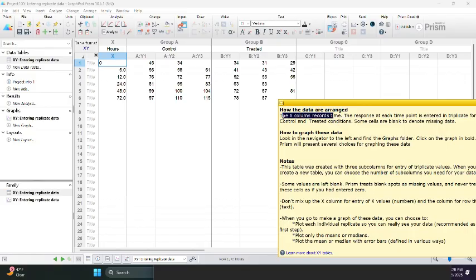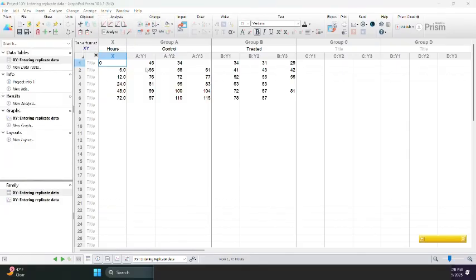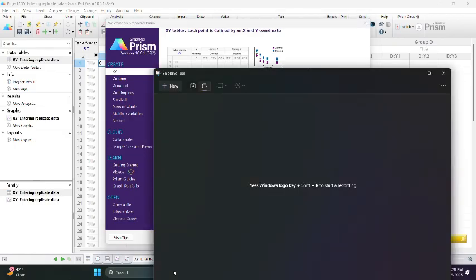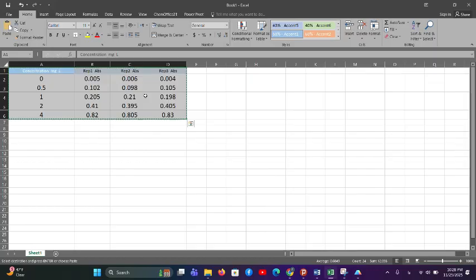So that's perfect. Here I have an analytical chemistry example for you. We're going to determine the concentration of copper ion in a water sample. We are using a UV visible instrument, and we want to know how this method works and if it is appropriate or not. So we're going to draw the calibration curve. Very first, we have replicated each measurement 3 times. So we replicate the measurement, and we have it in different concentrations.